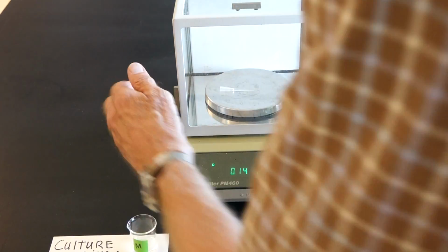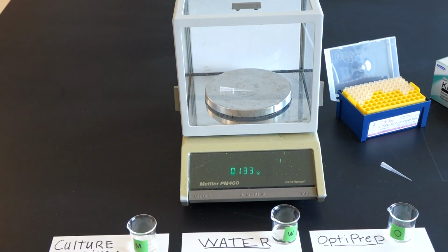And I get 0.134 grams per 100 microliters, which by moving the decimal place exactly one place to the right gives me a density of 1.34, and this is the density that is supposedly correct for that medium, which is 1.3, so I'm very close there.